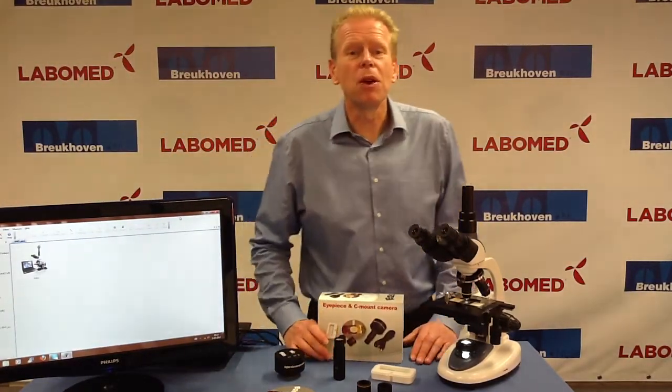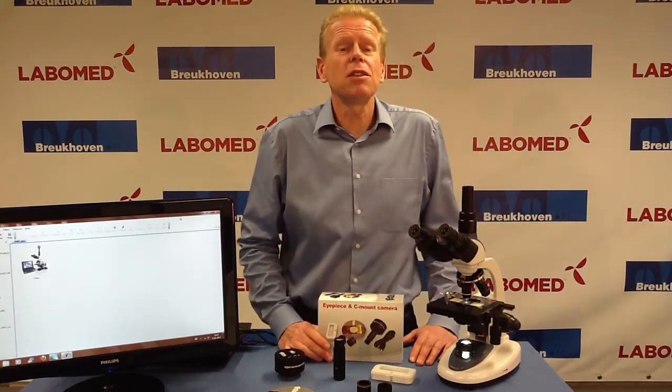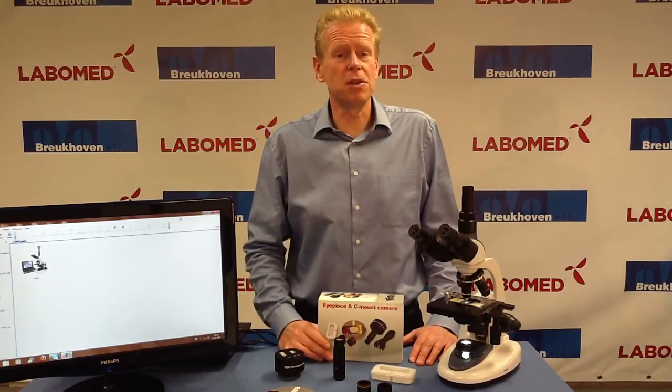Hello, my name is Bob Thiermans from Breukhoven in the Netherlands. I would like to inform you about our range of eyepiece cameras.